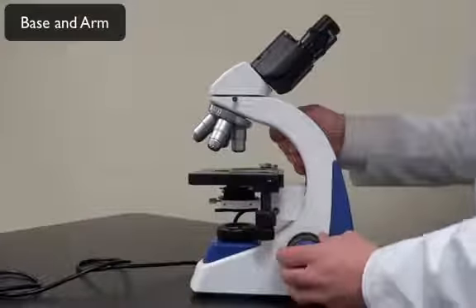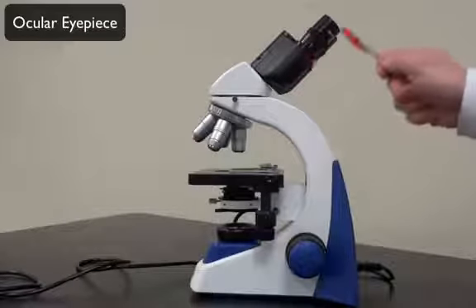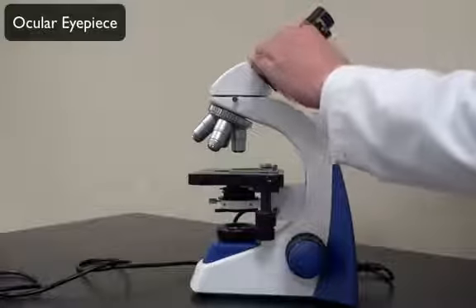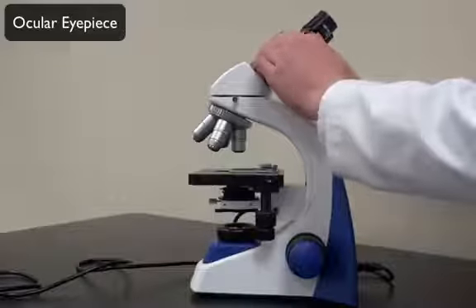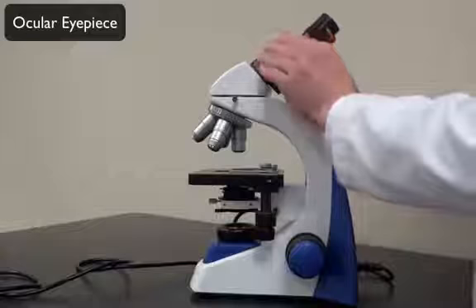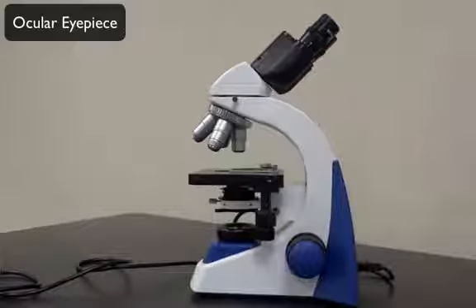Okay? So as you work up the arm, you'll see the ocular eyepieces here. Now the ocular eyepieces will adjust the width of your eyes. Everyone's got a little different width and different viewing points. There's no actual visual adjustment here. It's just more for comfort to be able to see into the microscope with both lenses.